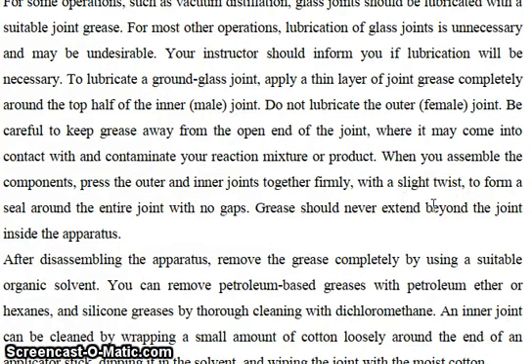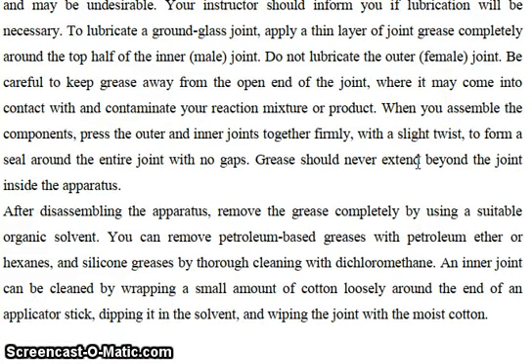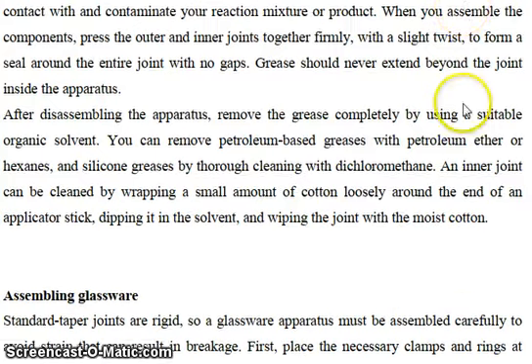After disassembling the apparatus, remove the grease completely by using a suitable organic solvent. You can remove petroleum based grease with petroleum ether or hexane, and silicone grease by thoroughly cleaning with dichloromethane. An inner joint can be cleaned by wrapping a small amount of cotton loosely around the end of an applicator stick, dipping it in the solvent and wiping the joint with the moist cotton.